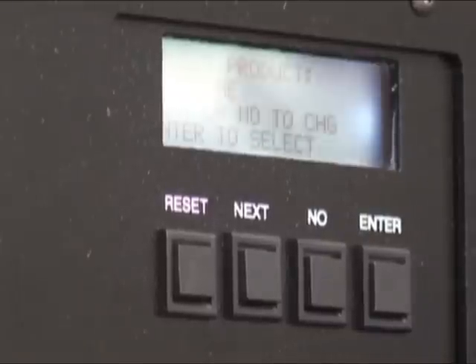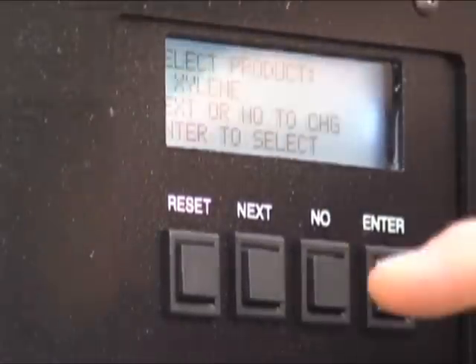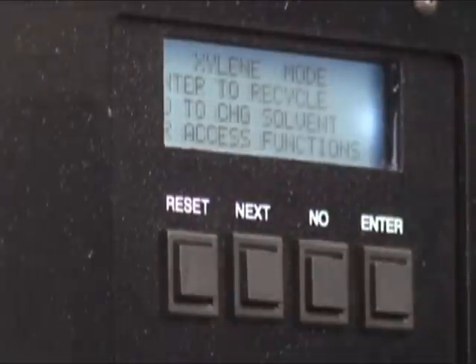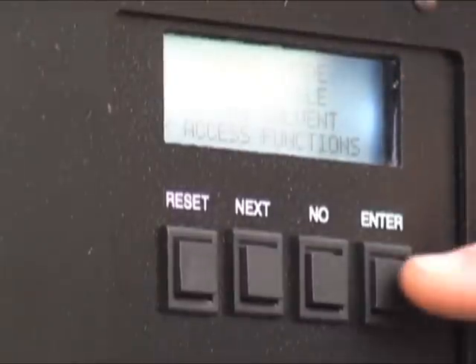Our systems are able to hold five different solvents at one time, so you can recycle multiple things with this unit. We're going to start with xylene — enter to select, enter. Just reset your system. This is how easy it is to run xylene. Xylene mode, enter to recycle.